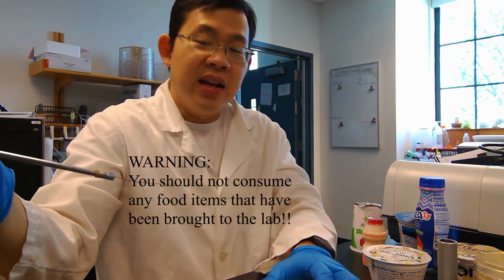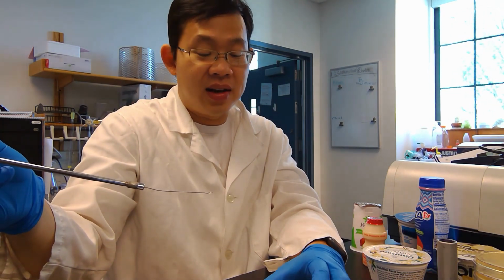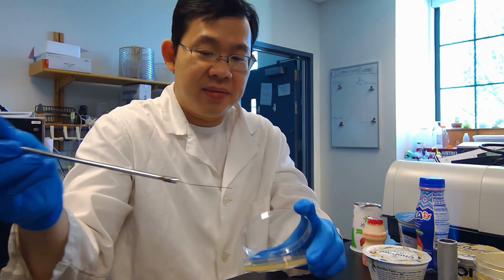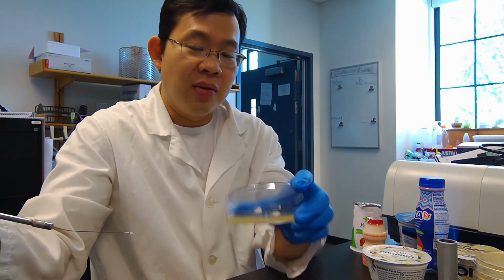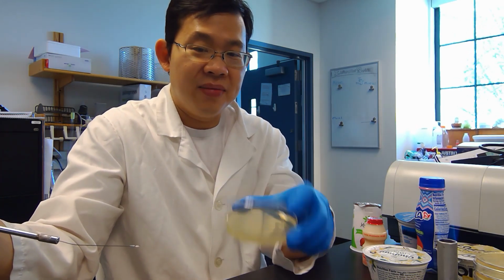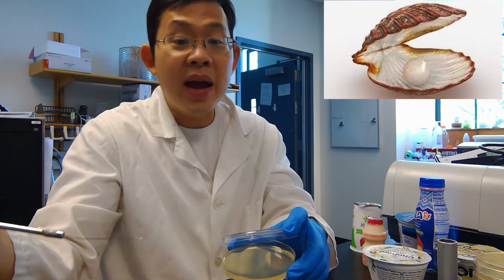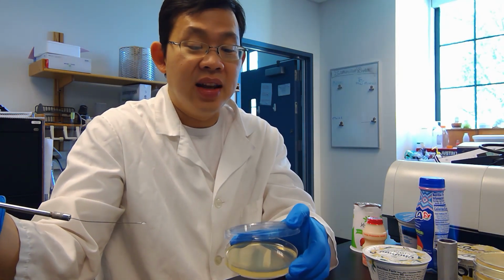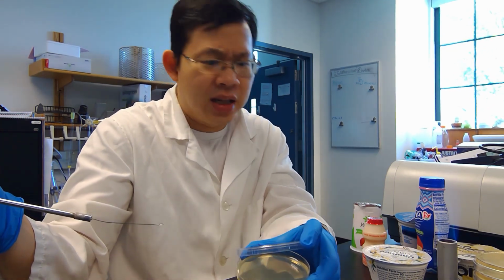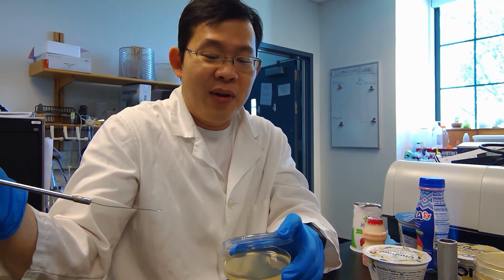Now, in the 4-quadrant streak, you want to make your first quadrant by depositing your sample in your first quadrant. So notice the way I open it. This is what I call the clamshell method. When you open it, you try to open the clam away from your mouth, so this lid serves as a shield in case, when you talk, especially me talking a lot right now, spit can fly off.